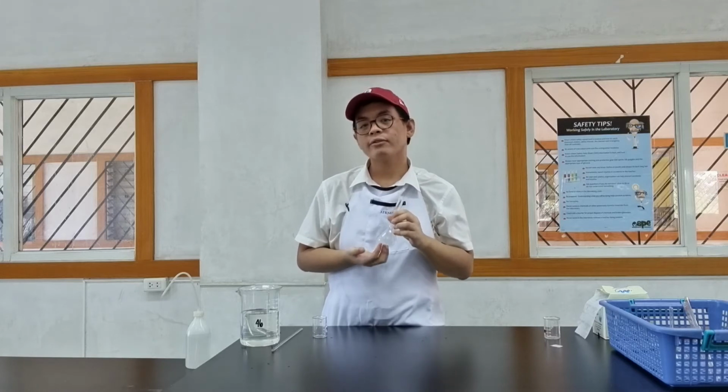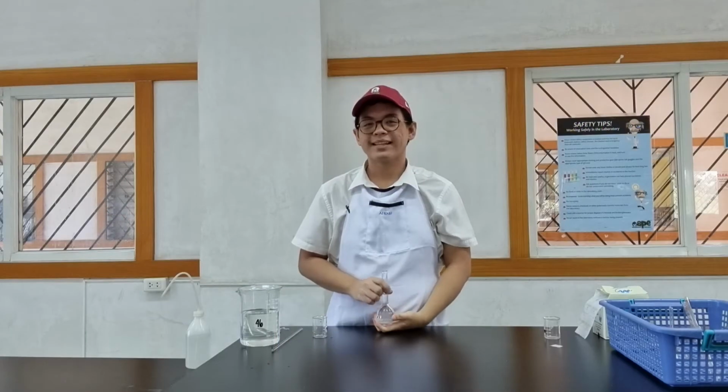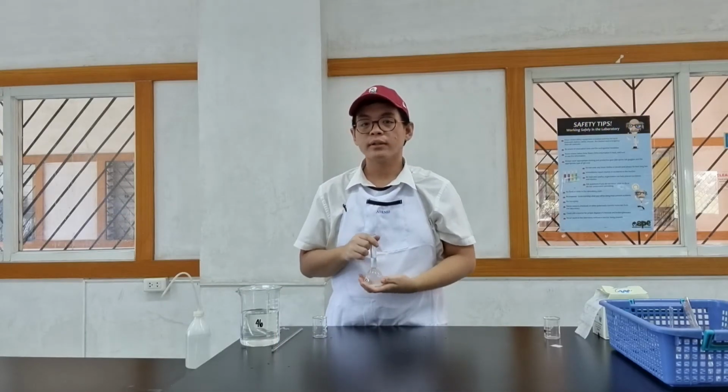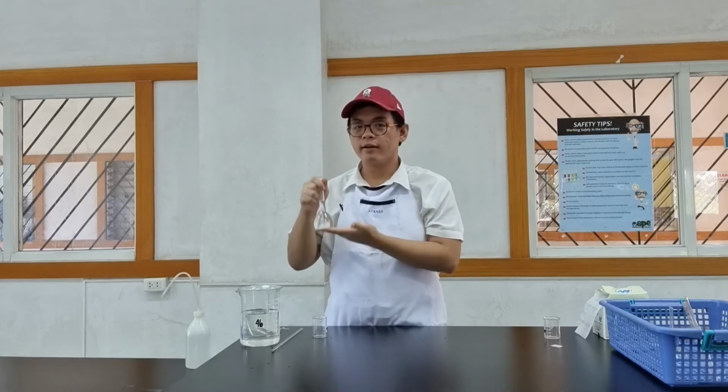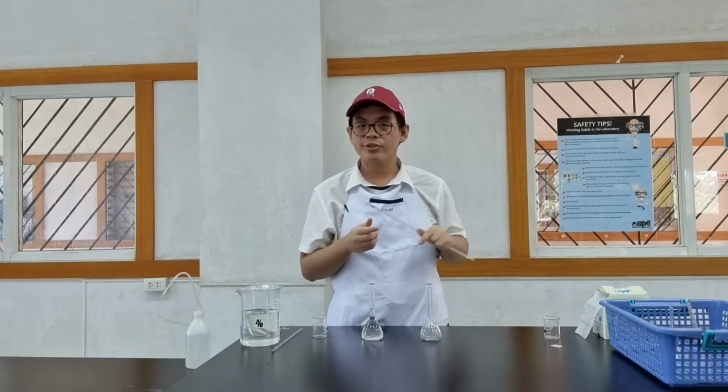Because I accurately know the mass that I used to create the solution, I could now calculate for the new concentration, again with the fixed value of 100 milliliters of solution. Now, let's do something else. What if I took 10 ml of this solution and diluted that to 100 ml in another volumetric flask? Let me show you how to do that.